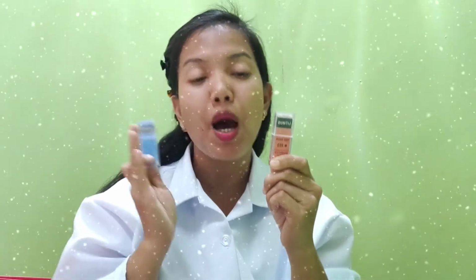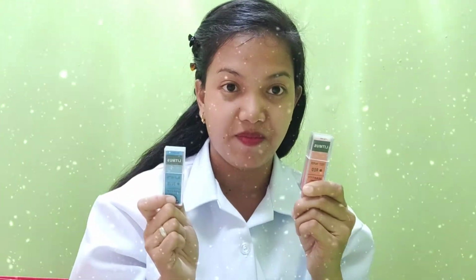So an acid has what we call properties, and so do the bases. So with these two litmus papers, when a substance is an acid and we use a red litmus paper, it stays red. That is one of the properties of an acid. Aside from that, it also has a sour taste.